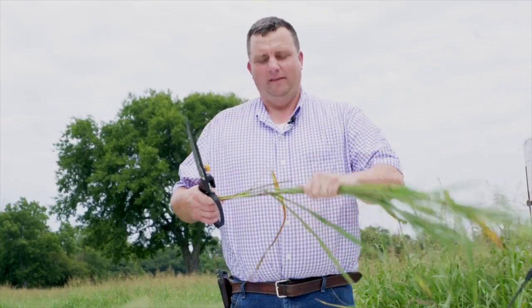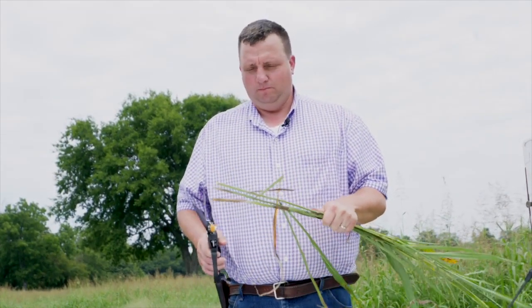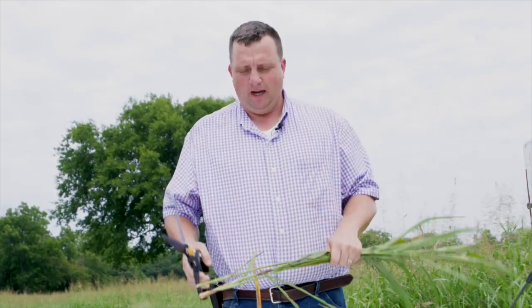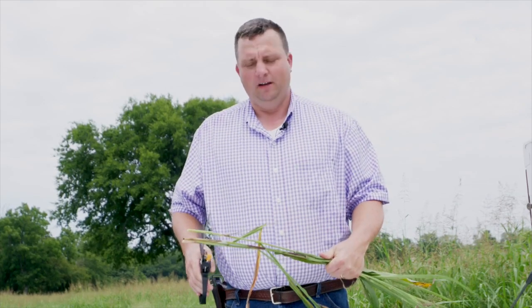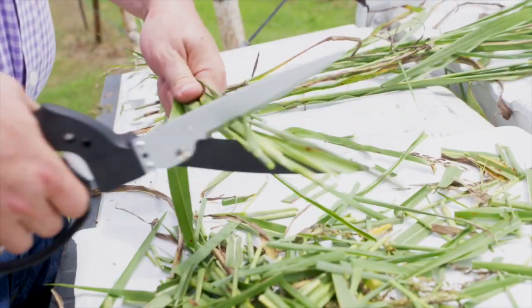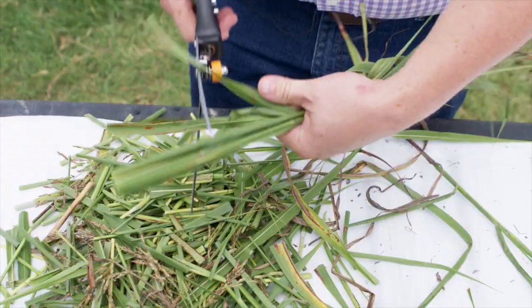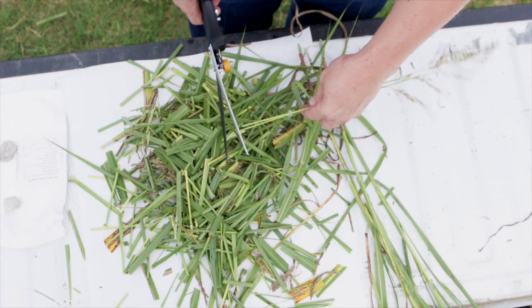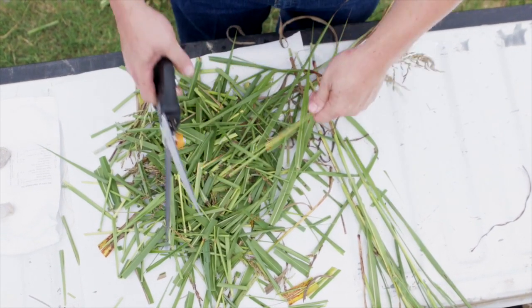Once you've collected a good random sample and run a diphenylamine test and determined you're going to send a sample to the lab for a quantitative test, you'll want to cut the plants up completely. We've got 15 stems here collected from random samples across the field. Cut them into about three-inch strips — that'll be leaves, stems, and the entire plant. Collect that on some kind of paper so you can keep the sample together.